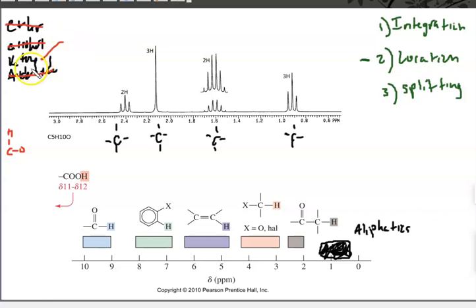Sometimes it's like two possibilities. Well, maybe it's an ether, maybe it's a ketone. In this case, there's no doubt it has to be a ketone. Otherwise, for these two, I would have peaks between the 3 and the 4 range. I don't have anything there. Okay? The aldehyde, I'd have something between 9 and 10. I don't have anything there.